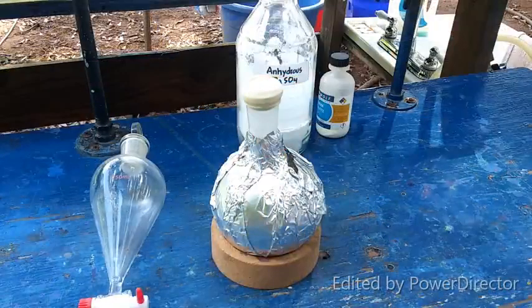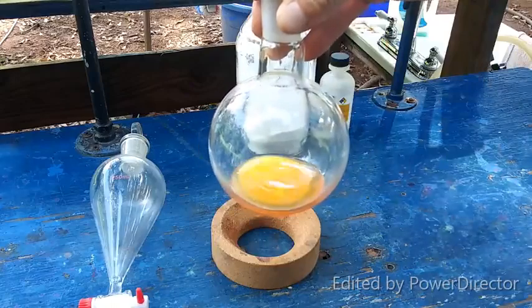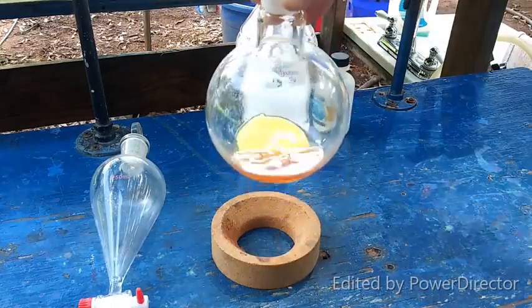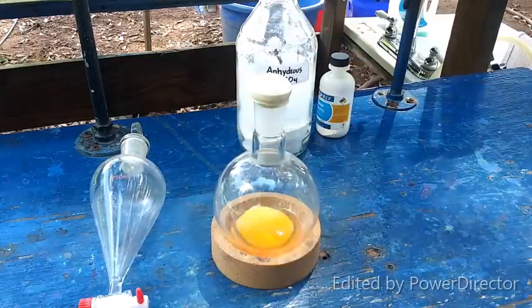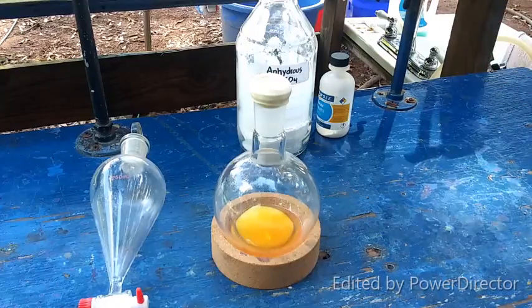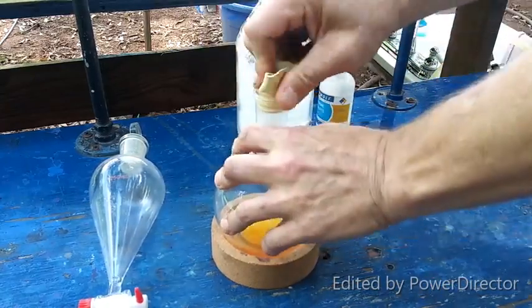Alright, everybody, so almost all of the acetone has been distilled off. You can see we've got a little bit here, and more, almost certainly sodium iodide has crystallized out. I am going to stop here though and go with this at this point. We are just going to run with it.